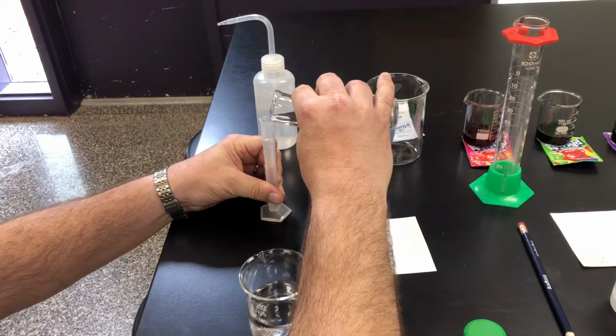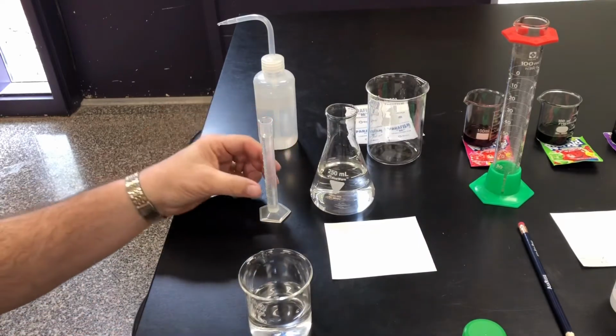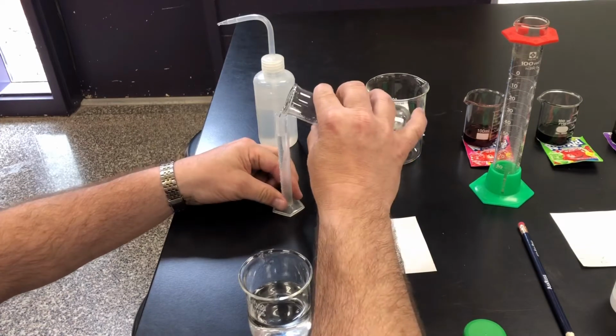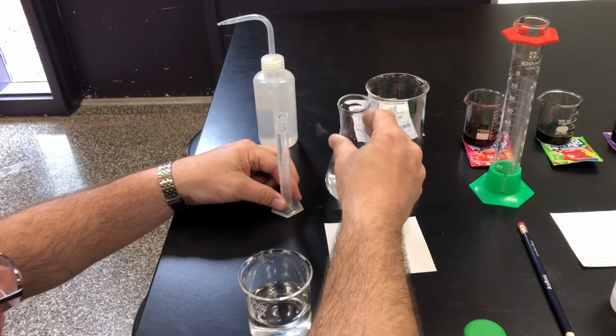What you didn't see is that I had already rinsed this once with salt solution, so it is salt only in there. There we go, there it is.